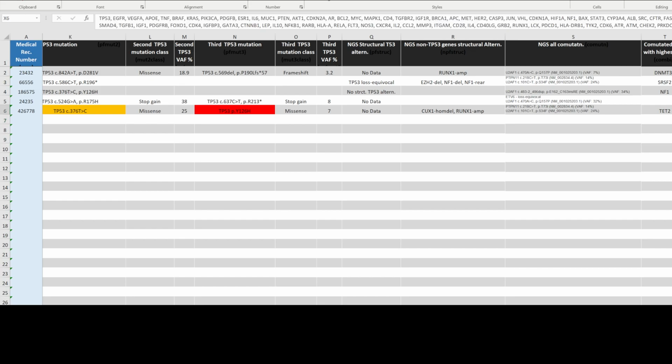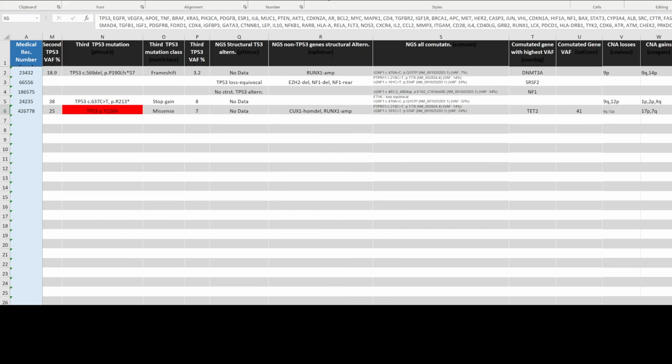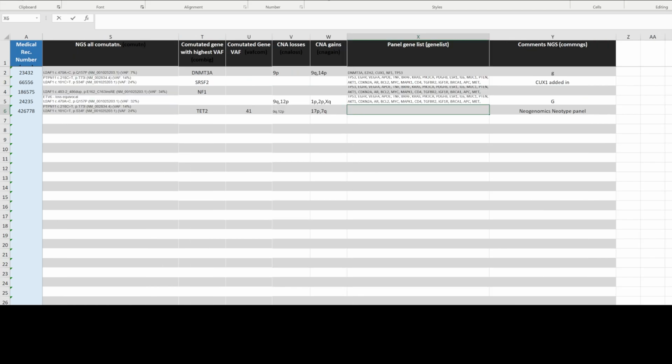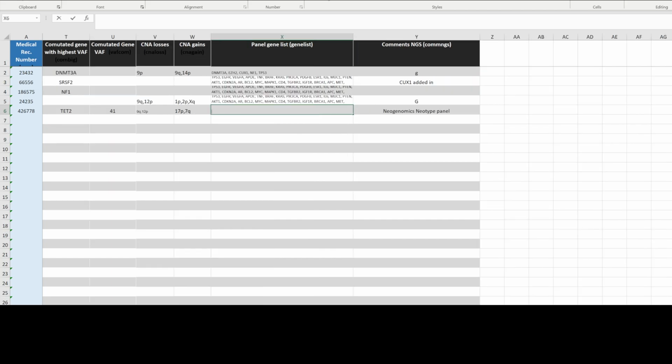Sorry, give me a minute here. Let me just show this again to you. So here is what we want to do. Let me get rid of this. Let me do the paste again because I don't think this was sitting in the field properly. Okay, here's the panel gene list back in focus. So I'll copy the whole gene list that I showed you, and I come to the cell, go up to the formula bar, Control V as in Victor, yeah, and enter. Right, that's the best way to paste things right into that field.